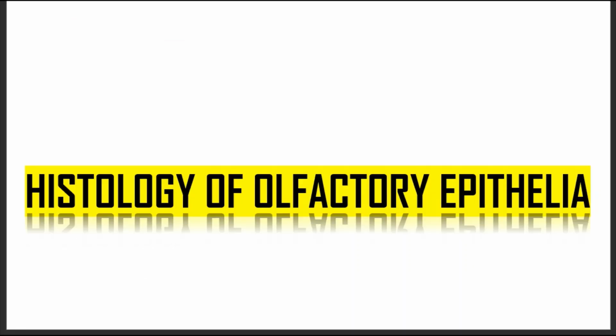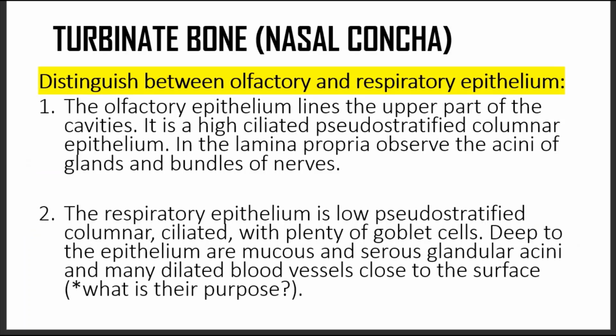All right. So now let's look at the histology of the olfactory epithelia that is found in the nasal cavity. The olfactory epithelia is found in what we call the superior concha or the nasal concha bone. Okay, that is found in the nasal cavity.